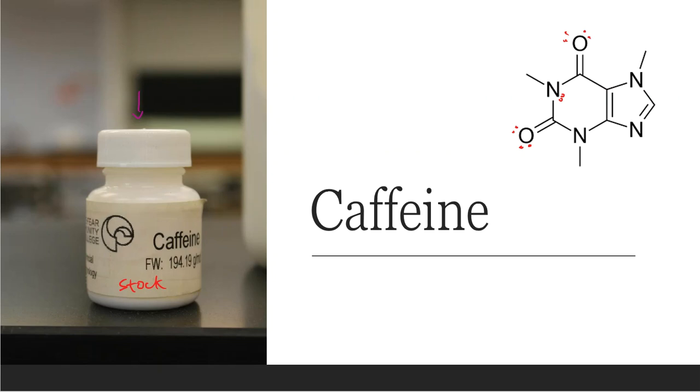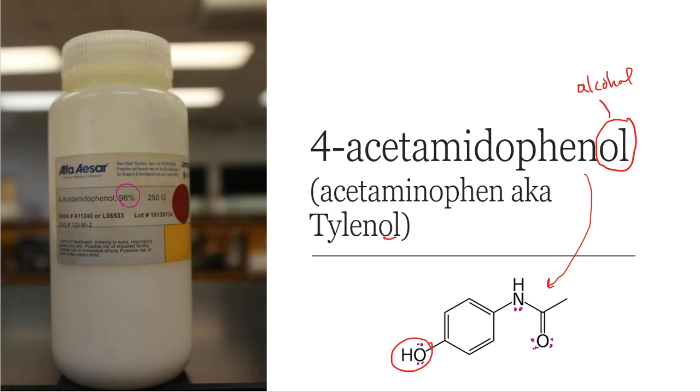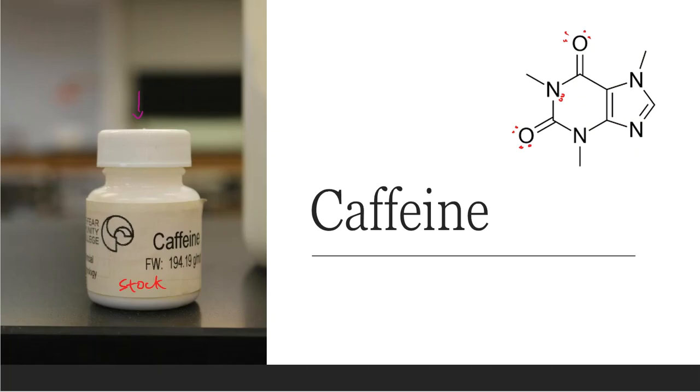So if I had to compare the difference between caffeine and Tylenol or acetaminophen, what I would see is that caffeine is going to be more polar. So now automatically I can start making decisions on how these things will behave on a TLC plate. Because if I have a TLC plate that has SiO2, and I have spotted caffeine on it, caffeine is going to like to hang out with SiO2 a little bit better than my Tylenol or acetaminophen. And the reason for that is because caffeine's more polar. So if it likes to hang out with the silica, it's going to stay lower on the plate because it doesn't have a tendency to move up. There's no need for it to move up. It likes where it is.